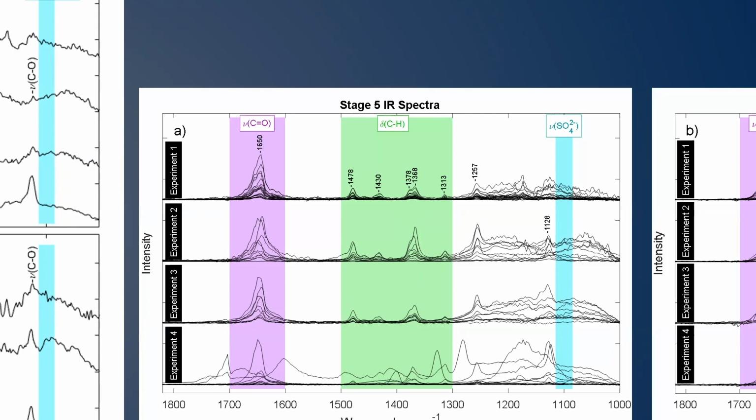And so now having both the Raman that we've had years of experience with, as well as these optical photothermal infrared spectra, we're able to really get a great feel for these different samples. So this is just one flavor of the way that we use Raman and optical photothermal infrared to analyze our samples.